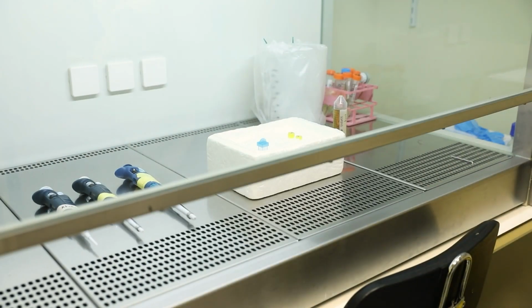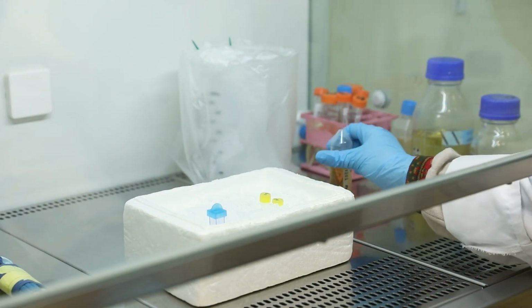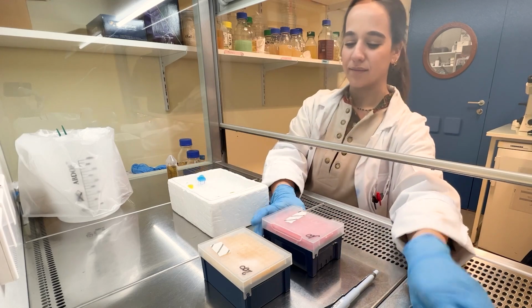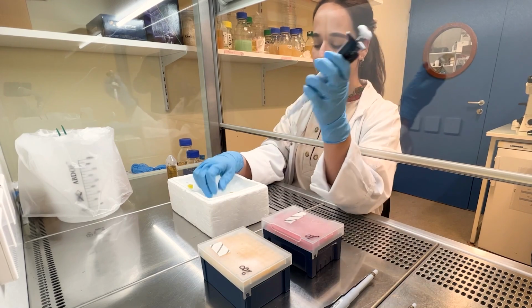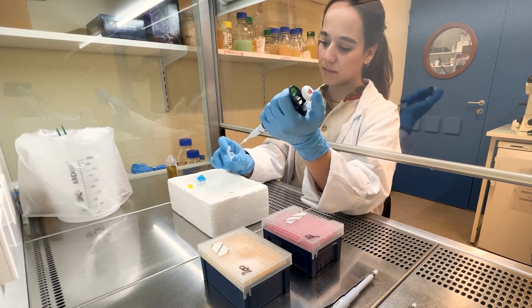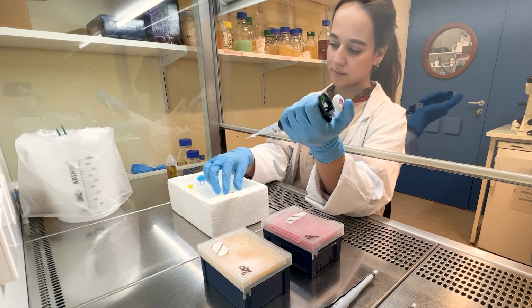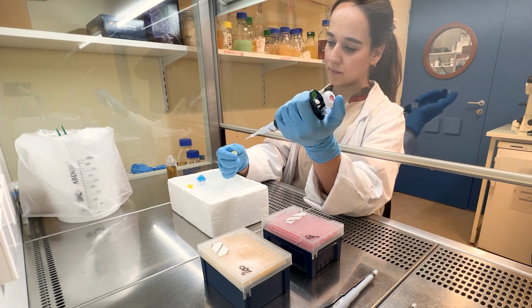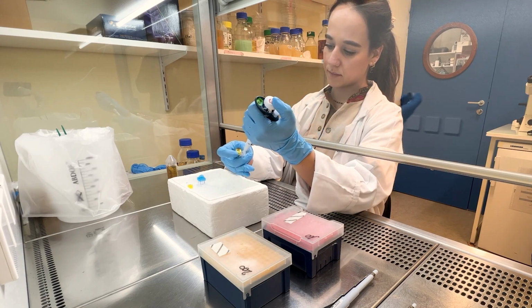First, an aliquot of competent cells is retrieved from storage at -80 degrees Celsius and is thawed on ice for 5 minutes under the hood. If transformation is performed by electroporation, an electroporation cuvette is also cooled down on ice. Then 100 to 300 nanograms of the plasmid DNA is added to the cells, and the DNA is left to mix with the cells for a few minutes on ice.